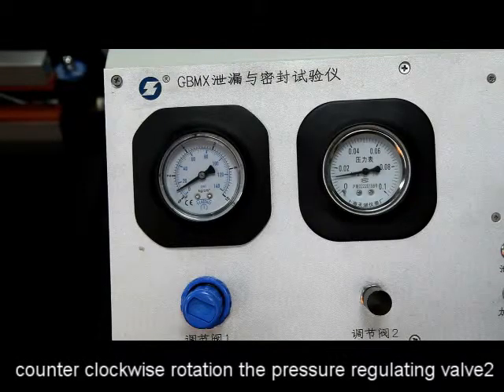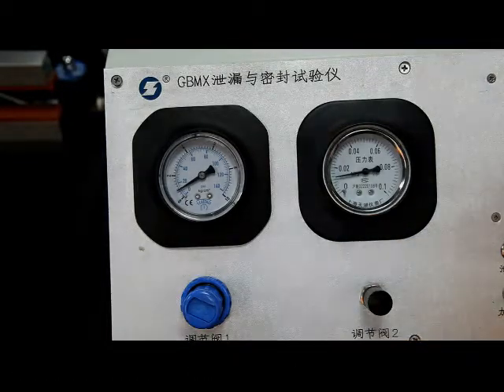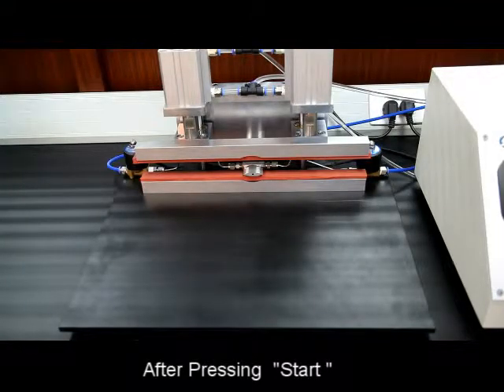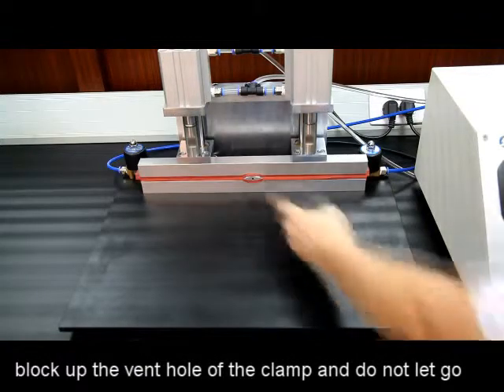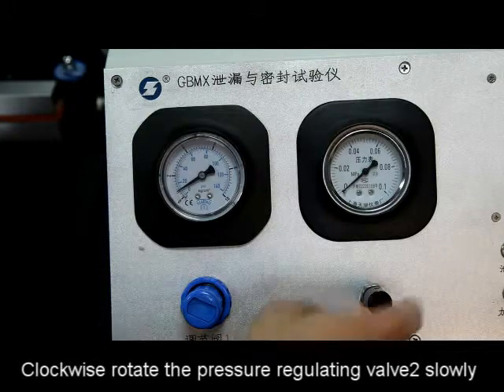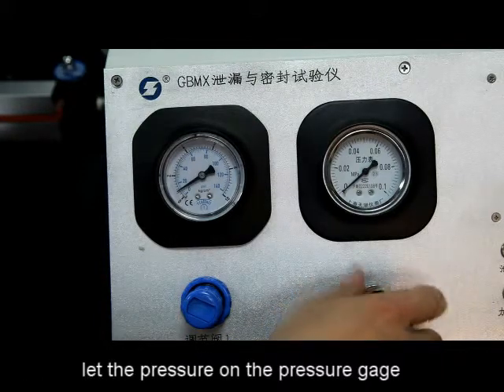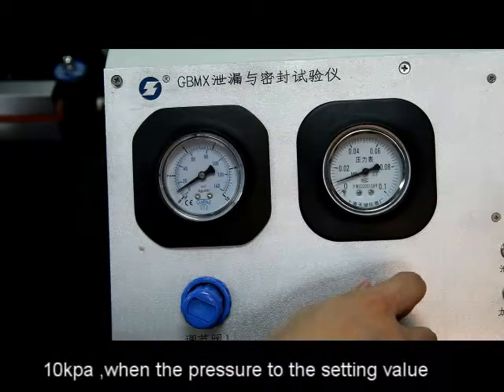Counter-clockwise rotate the pressure regulation valve to unscrew it. After pressing start, block up the vent hole of the clamp and do not let go. Clockwise rotate the pressure regulating valve slowly to let the pressure on the pressure gauge rise up to the setting pressure — 10 kPa.